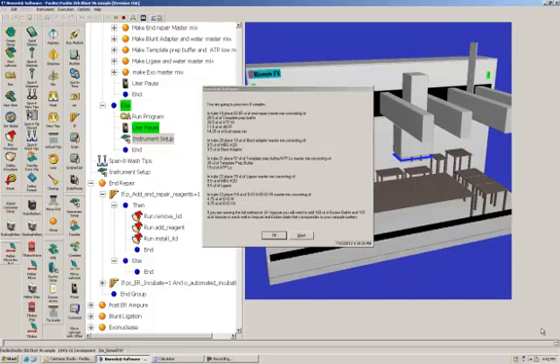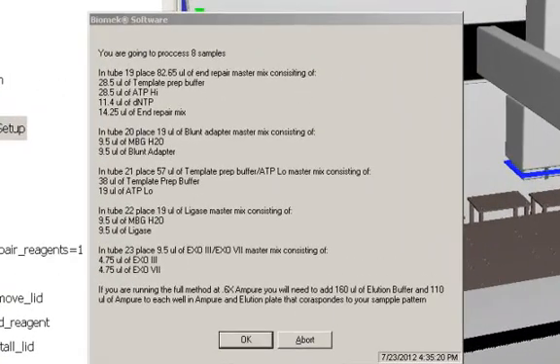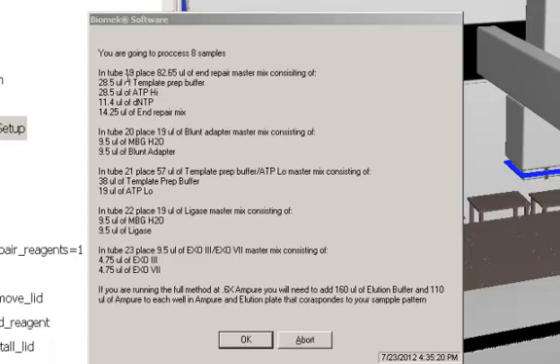And this is the screen that's going to tell us the volume of master mix we're going to need. And these volumes will change based on the pattern we set. In this example, we set the pattern for eight. And the number of extra samples we selected in the start of the method. So the more samples, naturally, the higher the volumes are going to be. And it tells you in what tube location in the cold block and what reagents you need to make the master mixes. At the bottom, it tells you you also need to place ampere and elution buffer in their plates on the deck. You only need to place it in the wells according to your pattern. But if you're going to run the full method, it tells you you need to place 160 microliters of elution buffer and 110 microliters of ampere in those wells that correspond to your sample pattern.